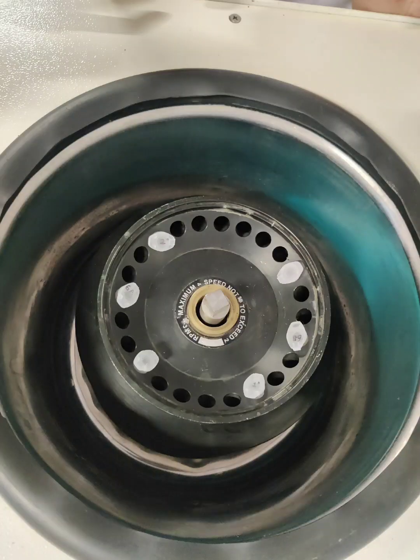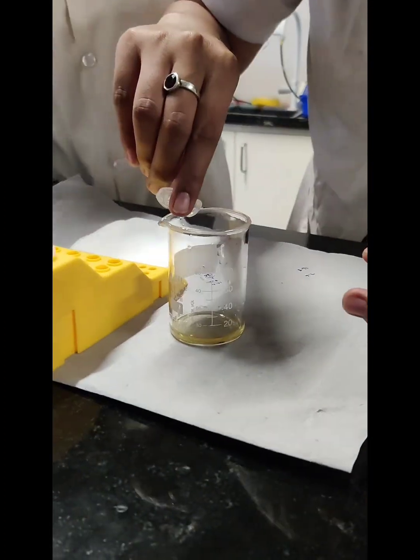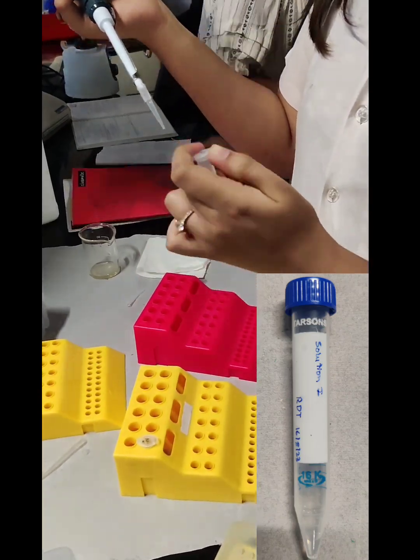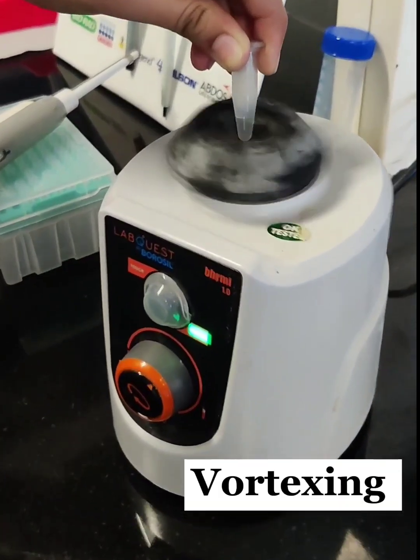We centrifuged the tubes at 10,000 rpm at 15 degrees Celsius, then carefully removed the supernatant. We added 150 µl of resuspension buffer to the vials, then vortexed and centrifuged them.